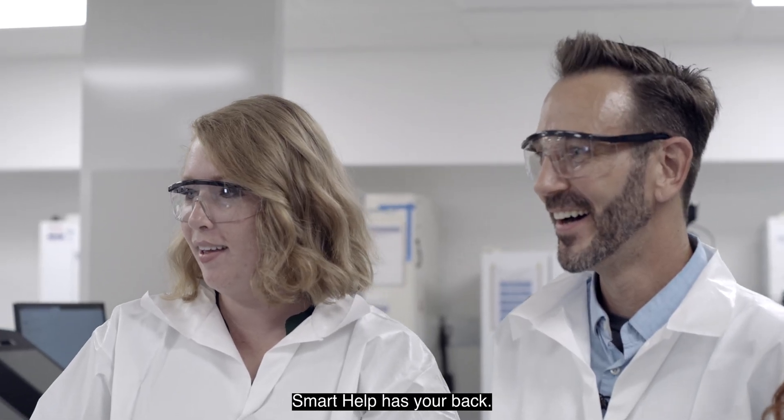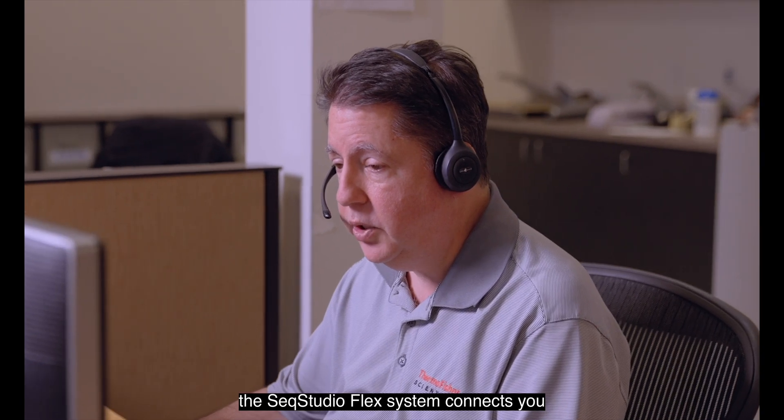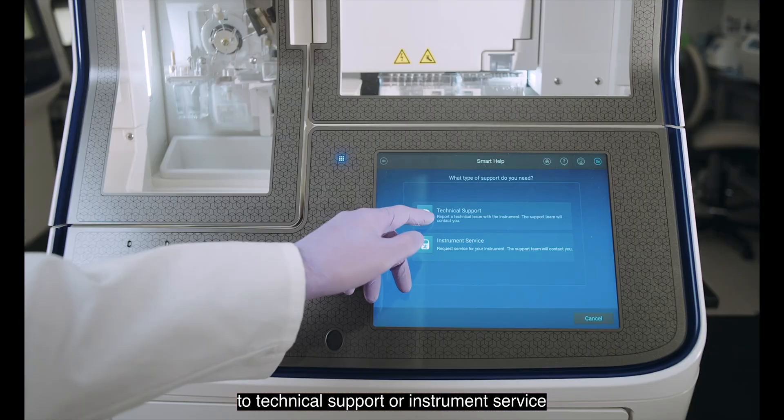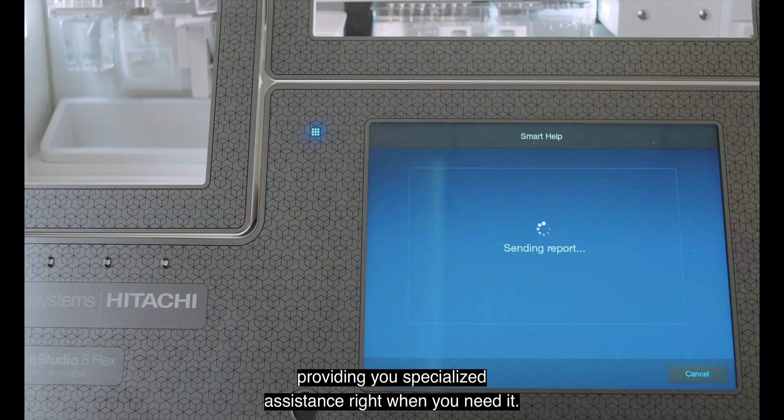Need assistance? Smart help has your back. Using the touchscreen, the SeekStudioFlex system connects you to technical support or instrument service with a single touch of a button, providing you specialized assistance right when you need it.